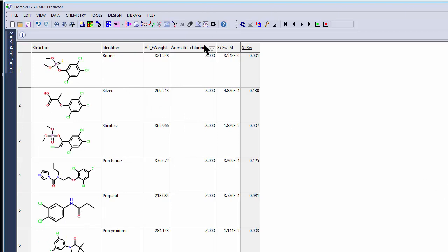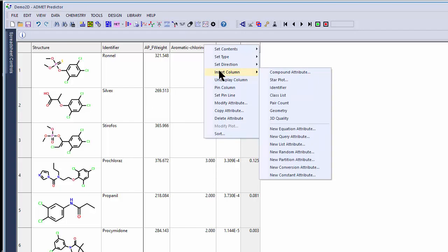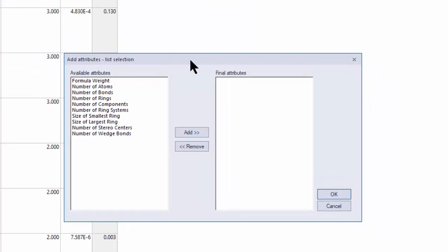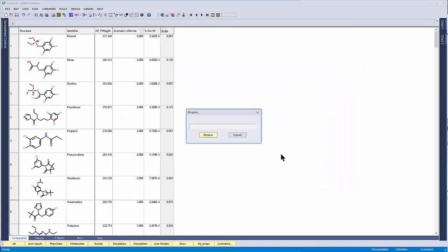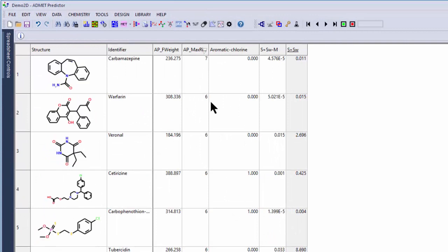The next one is a List Attribute. I'll go in here and click Insert Column, go down to New List Attribute. This opens up another dialog box with several options: formula weight, number of atoms, number of bonds, number of rings, number of components for things like salts, number of ring systems, size of the smallest ring. I'm going to add something called Size of the Largest Ring. This is going to be the attribute name AP_maxring. I'll click OK, sort on this value — it's got a seven-membered ring, then most of the others are six-membered rings.